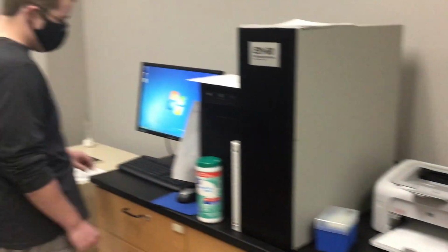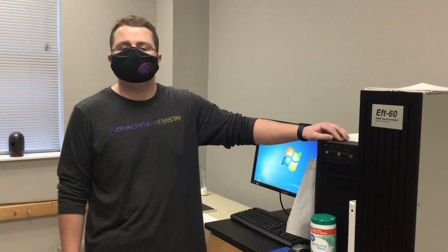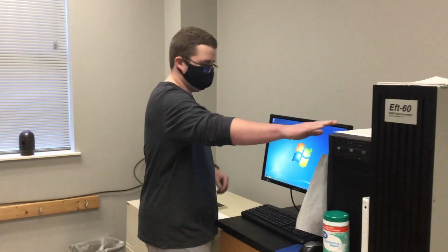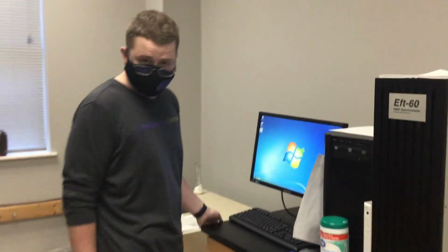If you decide to save anything on a USB, if you happen to take that graph off somewhere, and you bring one in, these USB ports on the front of this computer do not work, so you're going to have to stand over here, reach behind it, and get into the USB ports at the top and the back of the tower.